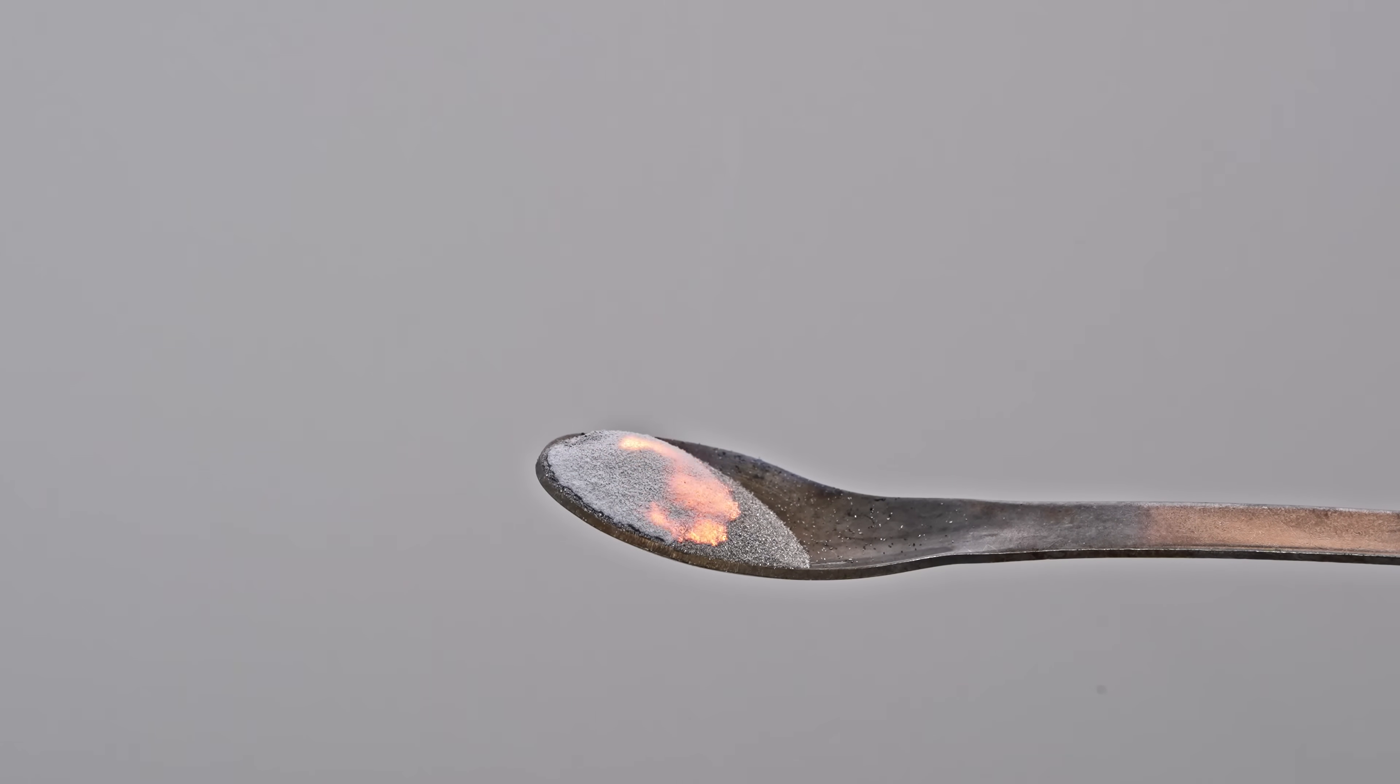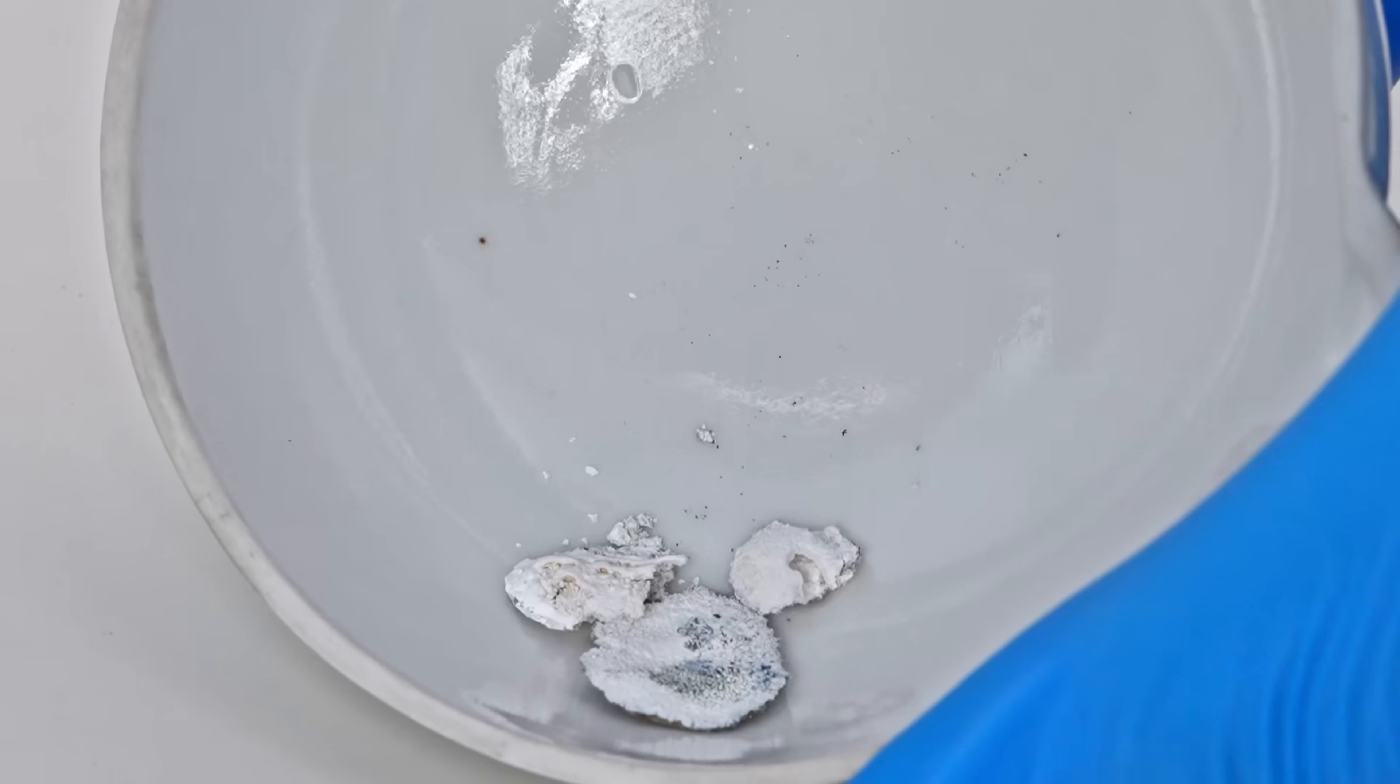When burning, magnesium reaches a very high temperature, and after it burns out, a white powder remains, which is magnesium oxide.